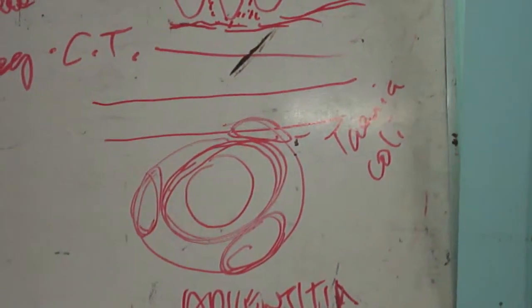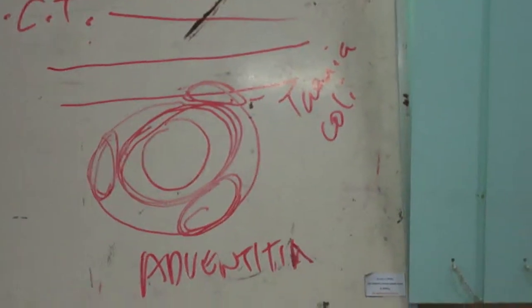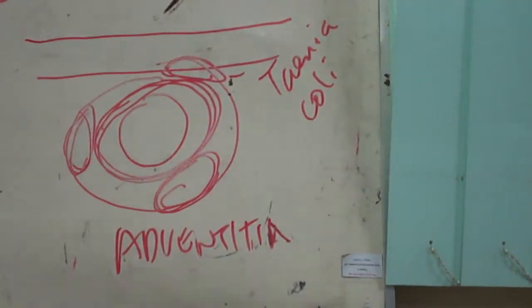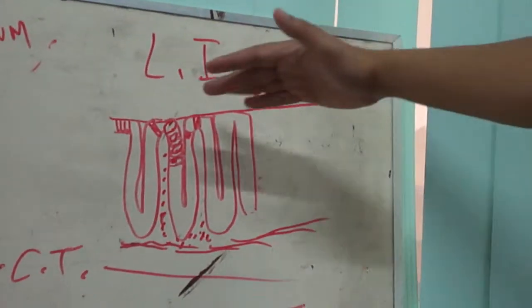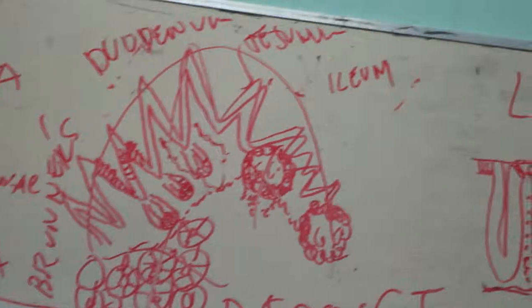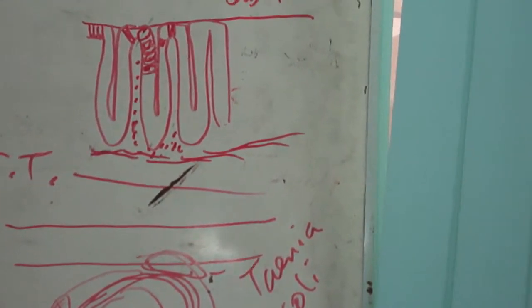So hopefully you can still remember the histology of the stomach. Kasi madali siyang ma-confuse with the large intestine and the small intestine. Tandaan nyo lang, pag large intestine, flat ang surface ng mucosa, walang villi na nag-project. Okay? And then the glands are of simple tubular configuration. Now, let us view your slides.